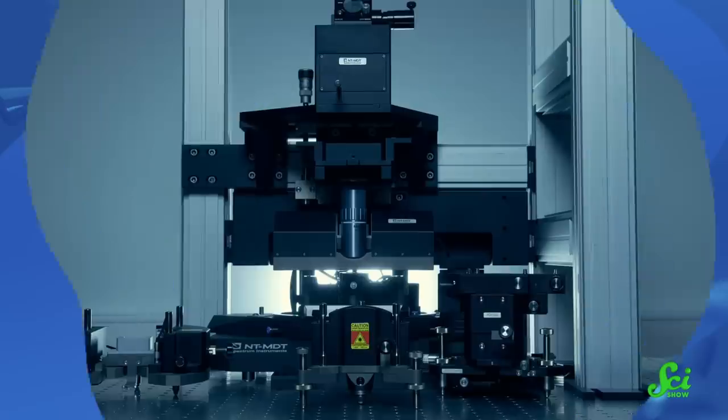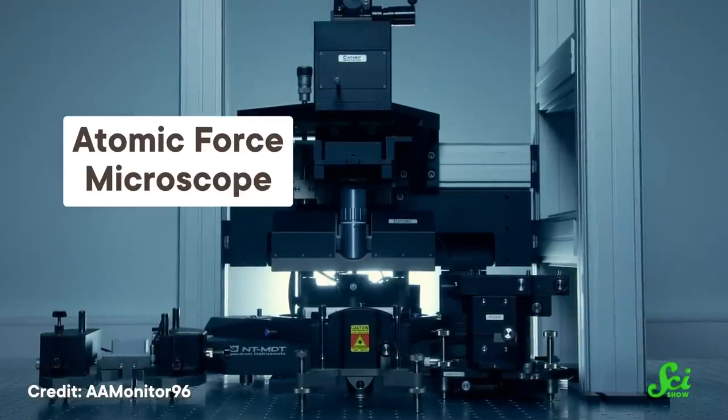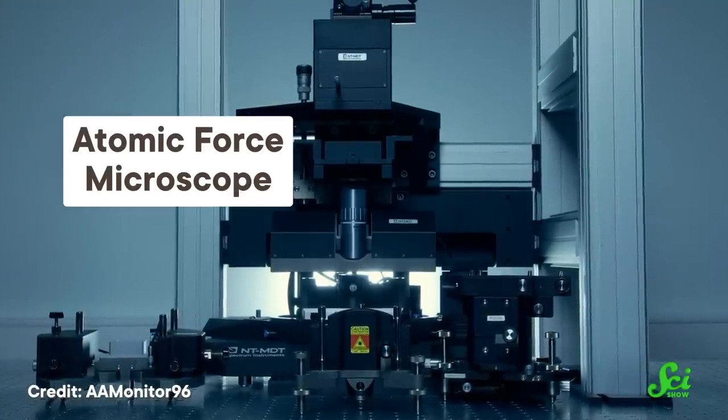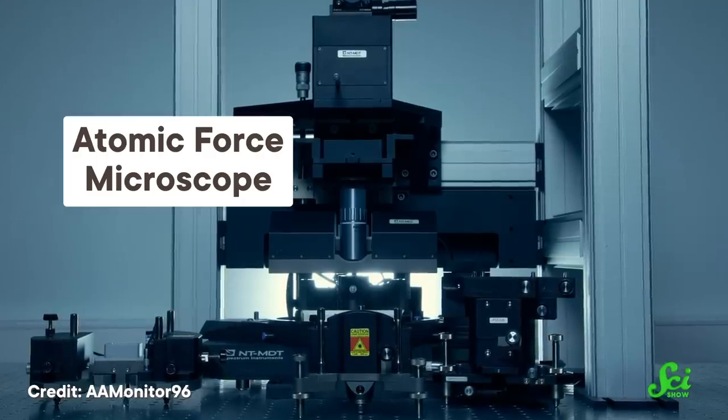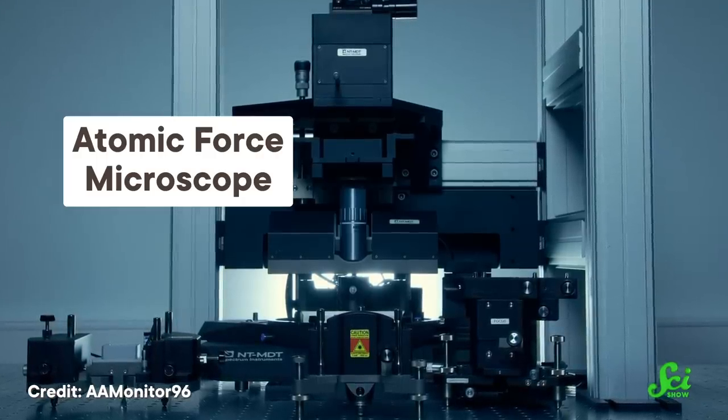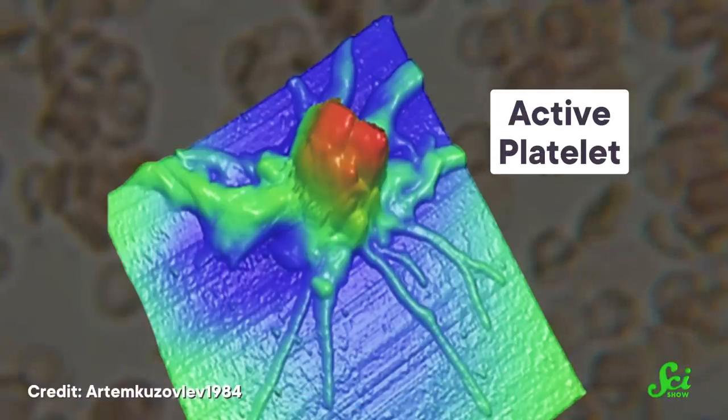But luckily, in the mid-1980s, scientists developed a nanoscale microscope that was a lot more merciful. The atomic force microscope, or AFM, doesn't need its samples to conduct electricity, so you don't have to coat them in some conductive metal. You don't have to freeze them, slice them up, or dehydrate them, either. AFMs also don't have to operate in a vacuum, so they can look at samples while they're in liquid, which is where a lot of life likes to hang out. Here's how they let us look at life in all of its living gooey glory.